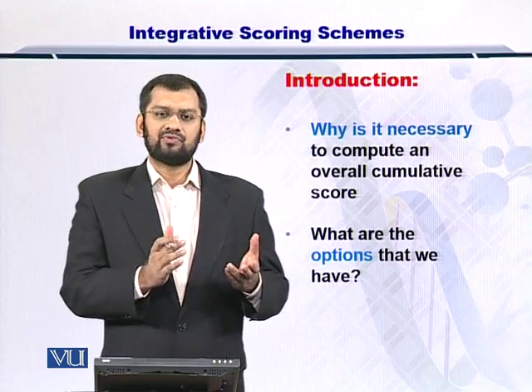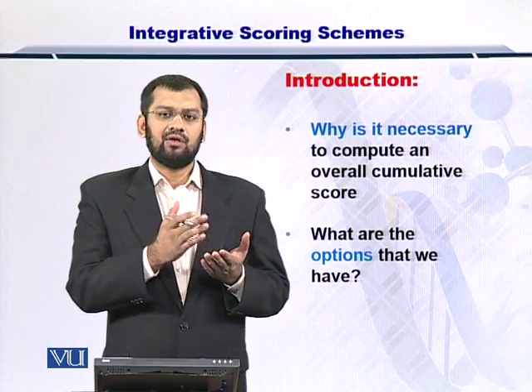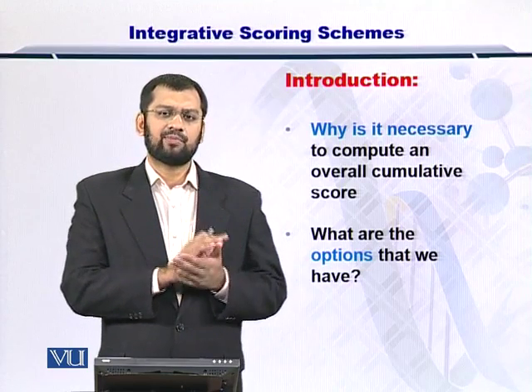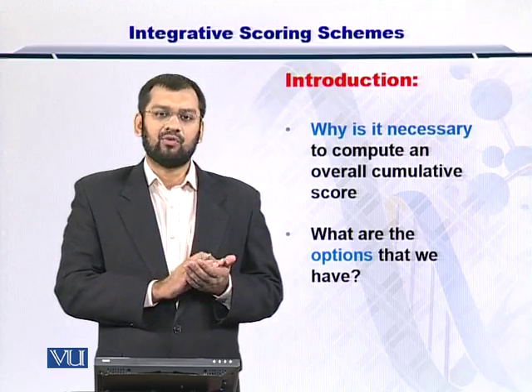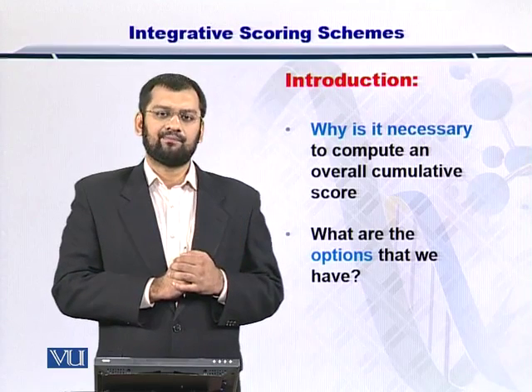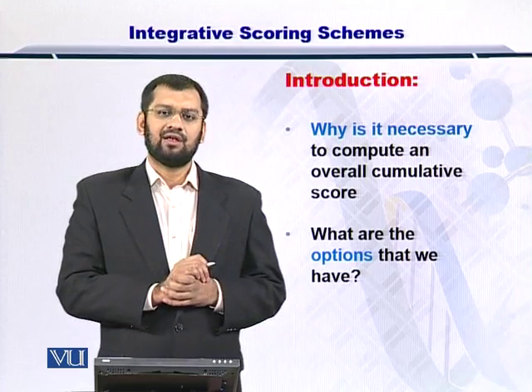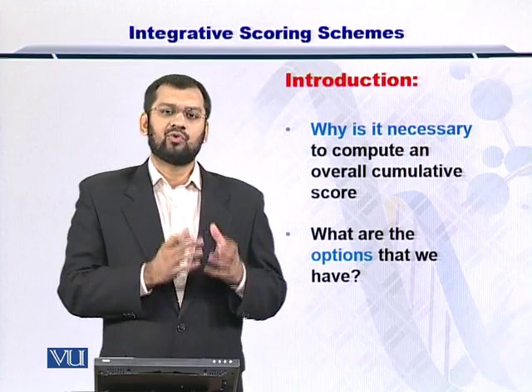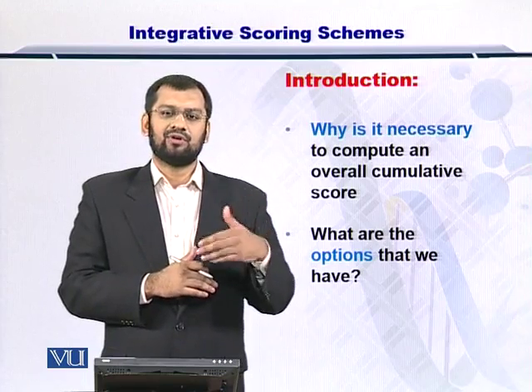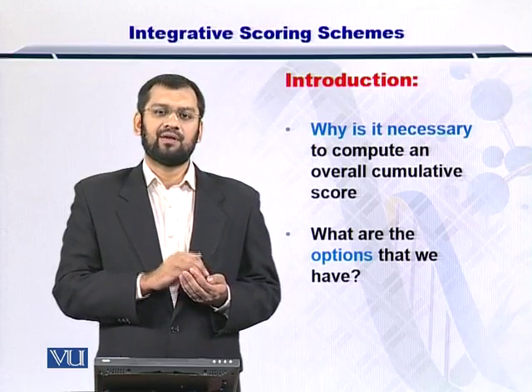For PSTs, we looked at the length of the PSTs and how they compare with the candidate protein. So that can range from, let's say, integer 1, 2, 3, 4, and so on. For the in silico and in vitro spectral comparisons, we simply got the counts: how many peaks matched with the in silico spectra. So this information is quite heterogeneous, and we need to integrate that into a normalized score in order for each of these components to have a meaningful say towards the final score. This is why this is an extremely important step in the protein search.